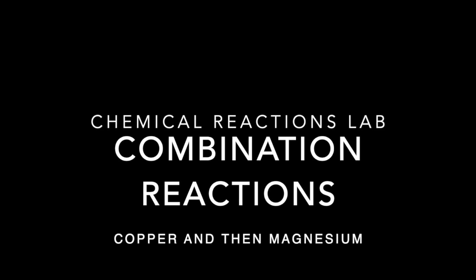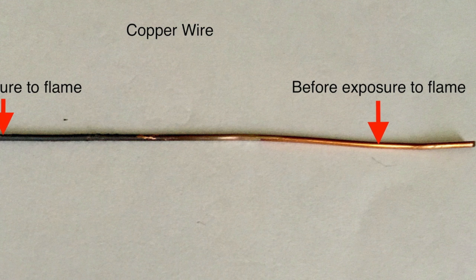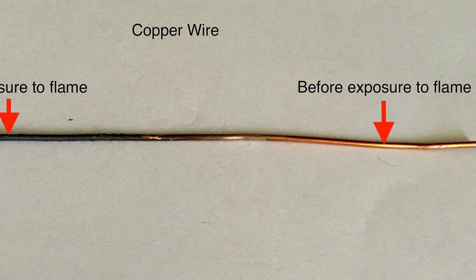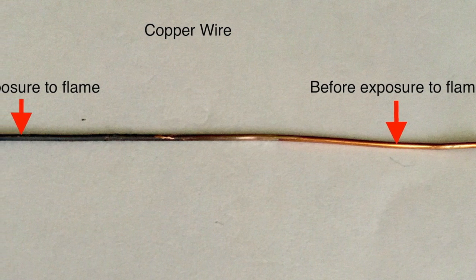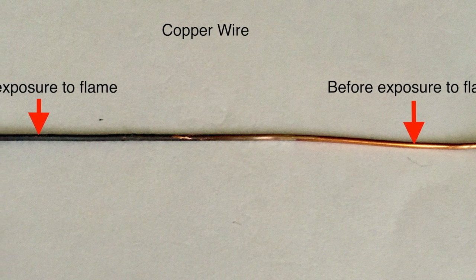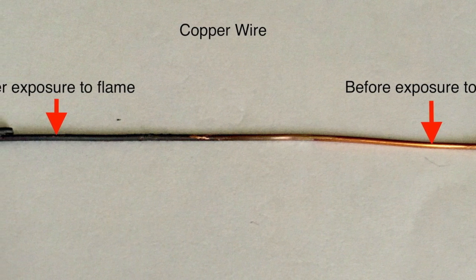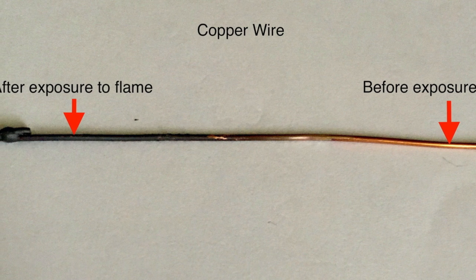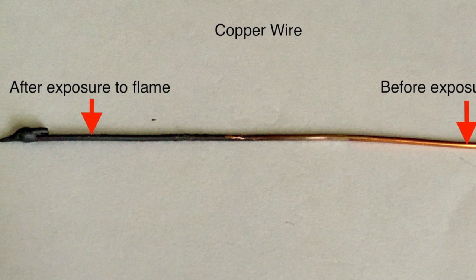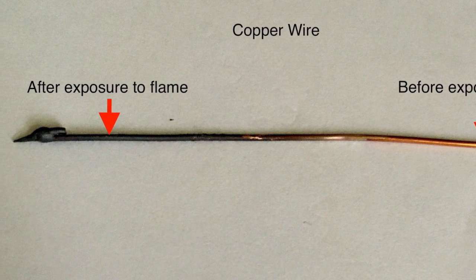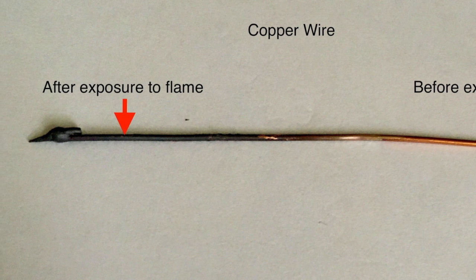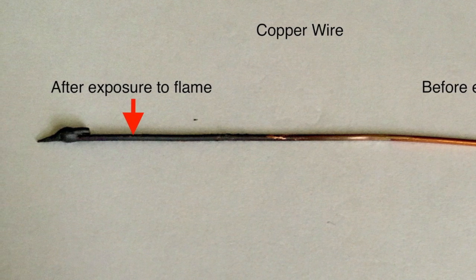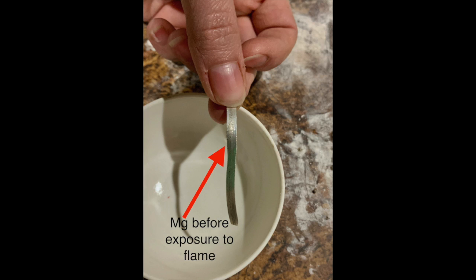We're going to see the results from the copper reaction first, then magnesium. Here you're looking at the picture from the copper wire experiment. I didn't record it, it's not very exciting. On the right-hand side, you can see what the copper wire looked like before I put it in the flame. And on the left-hand side, you can see what the copper wire looked like after I put it in the flame. In fact, I got it a little too hot and it melted.